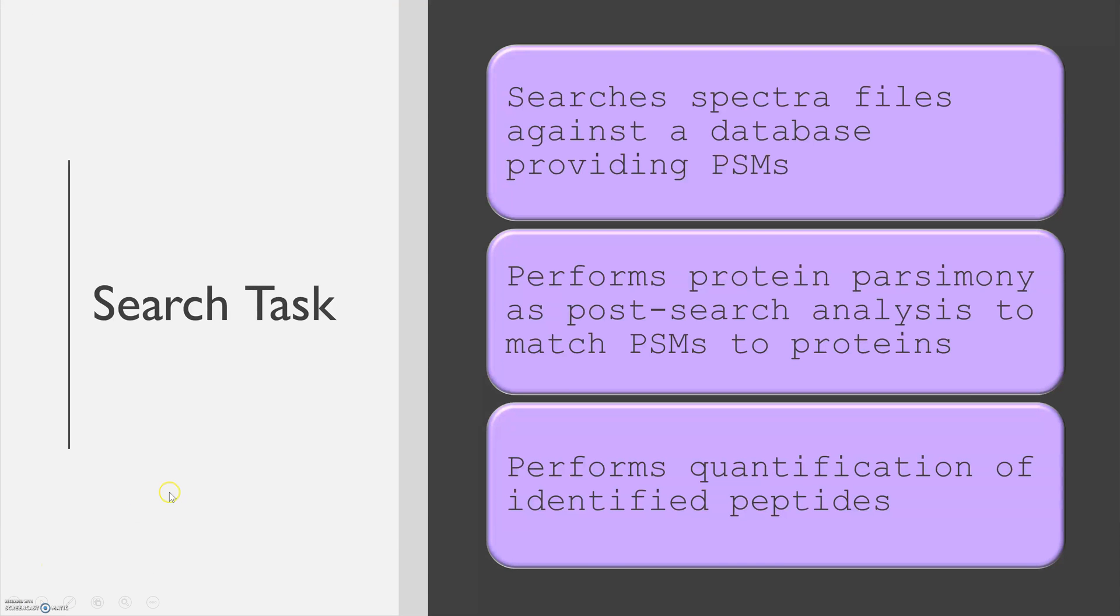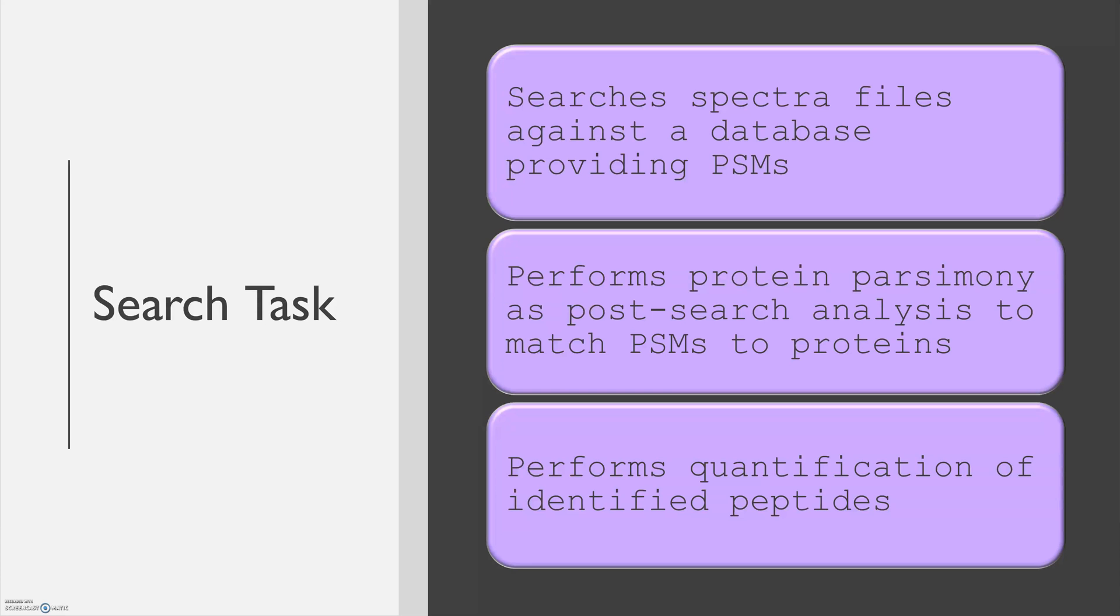Metamorpheus data analysis workflows are divided up into tasks. A search task searches Spectra files against databases providing PSMs. It also performs protein parsimony as a post-search analysis to match PSMs to their proteins. It can also perform quantification of identified peptides.